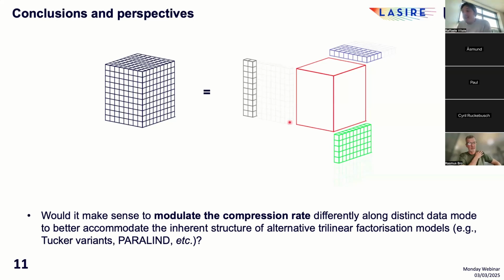So this will mean that you can always increase the number of components. Of course, you will pay the price of having to analyze a larger number of samples, but sometimes we had surprising results also in this particular scenario when dealing with minor components. That is to say, among the 7, 8, 9 components, you have sometimes one component that only appears under few pixels. I agree with you.